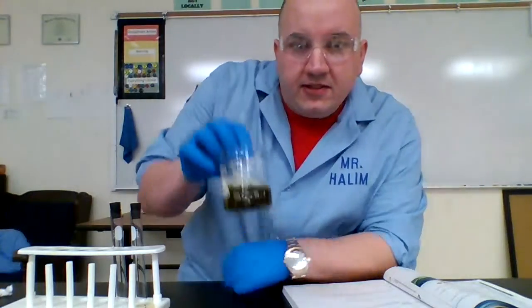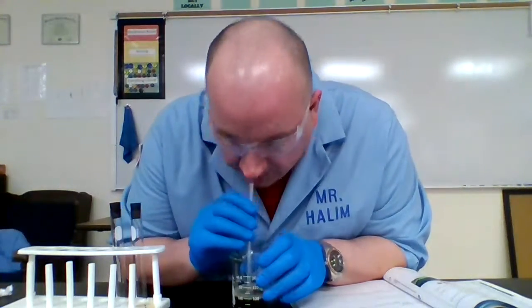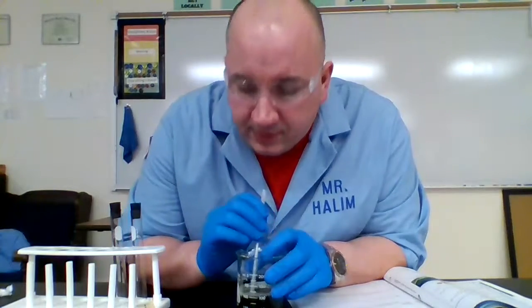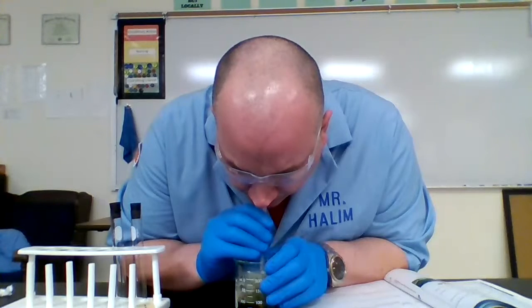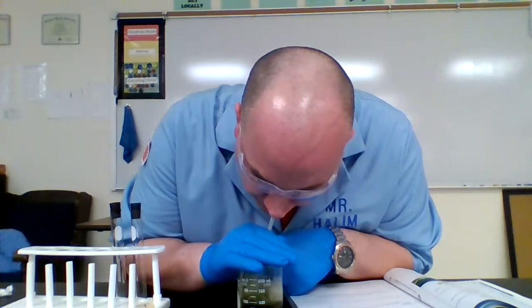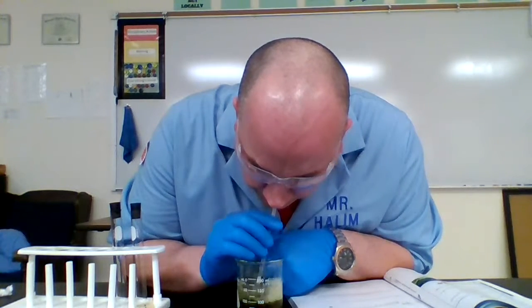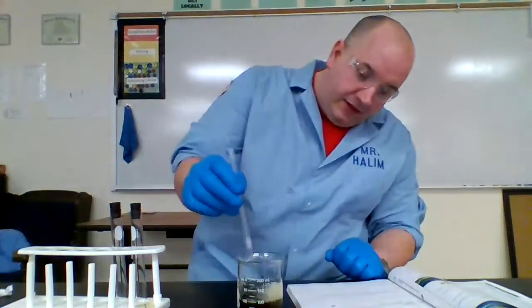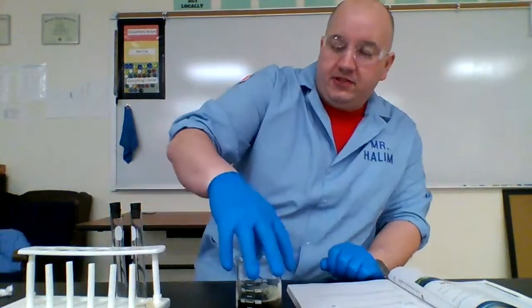All right. As you see, it's difficult to see on the camera, but mine is a very dark shade of yellow. I'm going to exhale into it just a little bit more. All right, that should be good. Now the straw, you're going to need to dispose of properly, please.